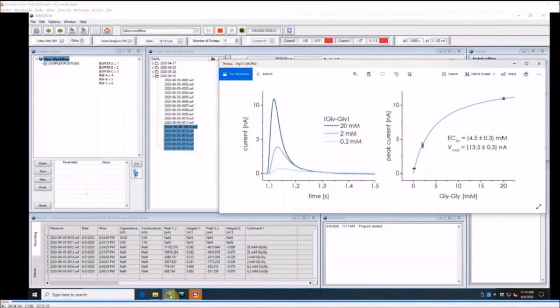And then the second part was whether you have to exchange the sensors manually in the N1 system after each experiment. What you can do automatically is run a sequence on one sensor. So you can do up to 30, 50 measurements in sequence automatically, but then somebody has to exchange the sensor for the next cycle. This is why we have the automated system, the 96SE, which is for higher throughput.